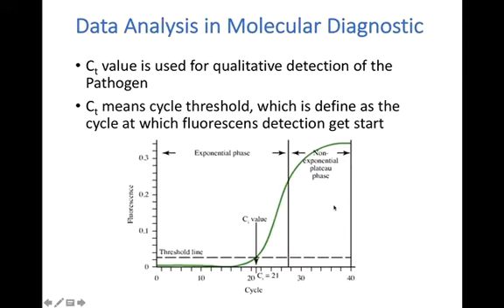And here we go for the basic detection formula of the SARS-CoV-2. Actually, in the diagnosis, the CT value is being checked for either the presence or the absence, and every kit has its own threshold values for the CTs. The CT is basically a cycle threshold value which shows at which cycle the detection is started.